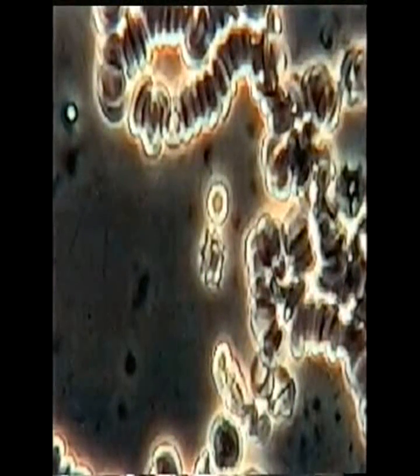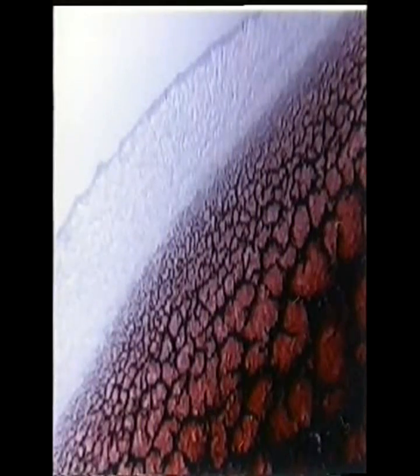We want to show you the effect of EMX on the structure and function of human blood. Using the darkfield method, blood cells are made visible, and with the phase contrast technique, even transparent structures like fungi can be seen in live blood. Thirdly, we will see coagulated blood in which free radicals can be observed.